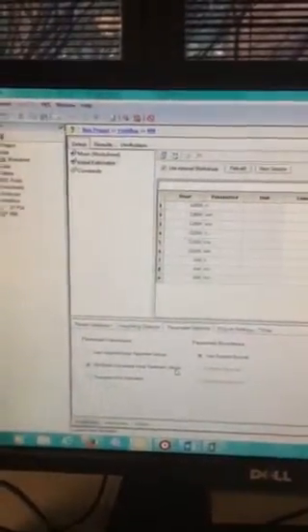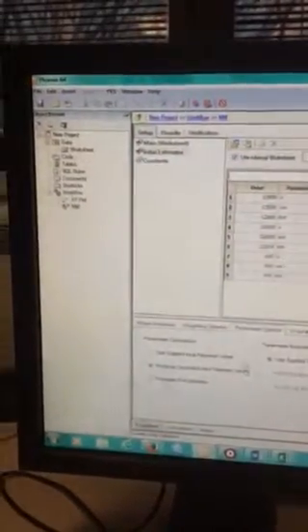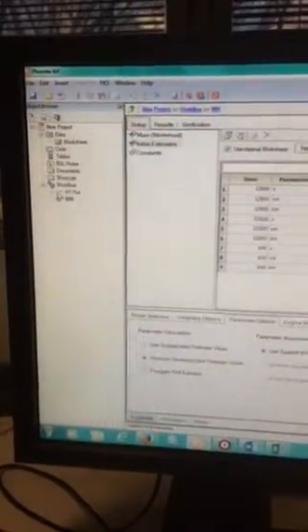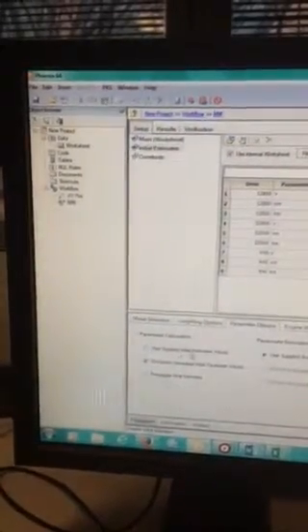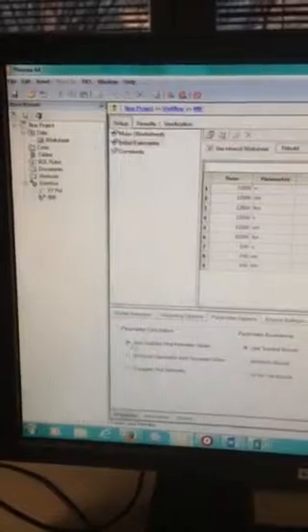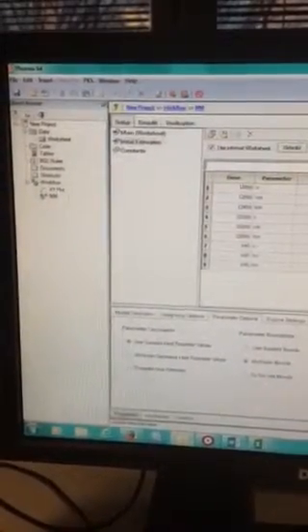The initial estimate, I want to use the initial worksheet, the dose, that is mine. And now, by default, it's giving me the Nonlinear generated parameter, but if I use this one, it's going to crash, give me an error. We can try, but what we have to do is user supply the initial parameter values. And I would suggest to use the Nonlinear bounds.